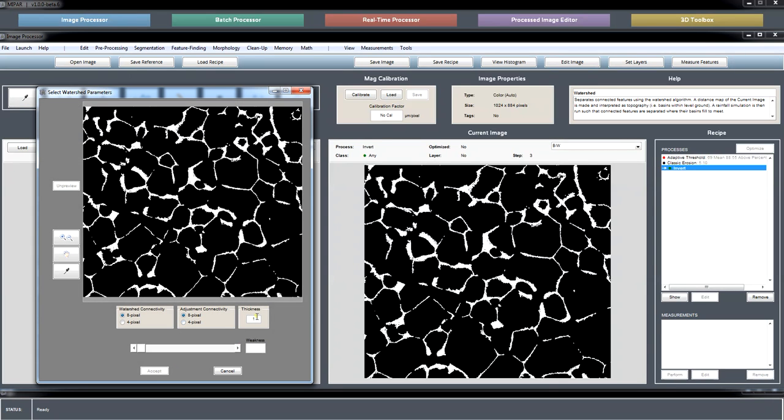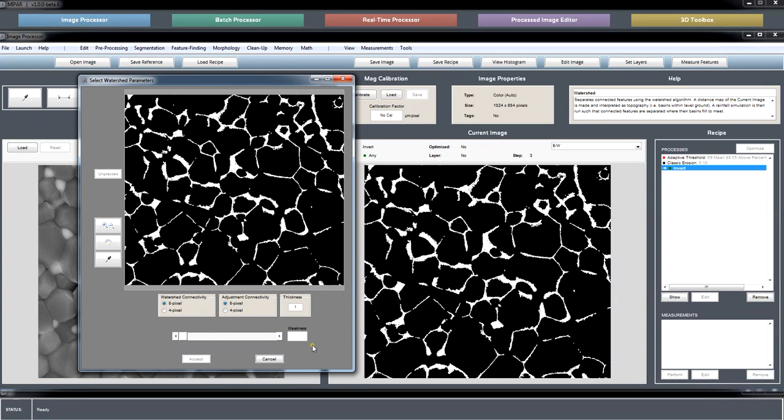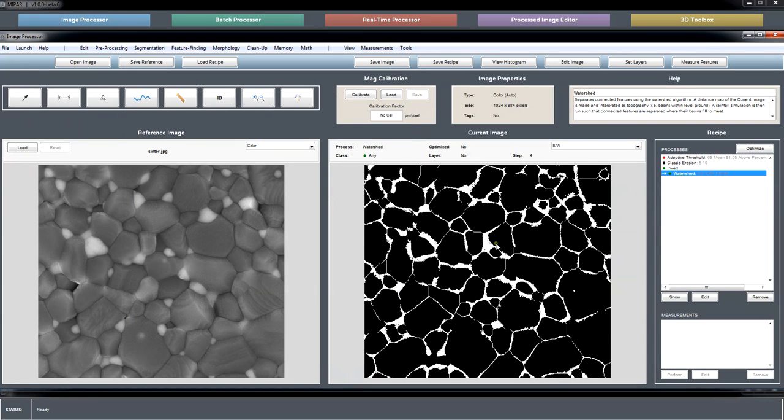Now we can run a watershed step, and I am sensitive or aware that these ranges can be not ideal sometimes, the slider ranges. So if you drag this to the center, almost never are you going to be operating up at 88 of a weakness value for watershedding. For separating black and white features, I'm almost always down under 10. For watershedding a grayscale image directly, instead of splitting up binary features, I'm usually up between 10 and 30. So I am going to change some of the default ranges of the sliders so that they make more sense.